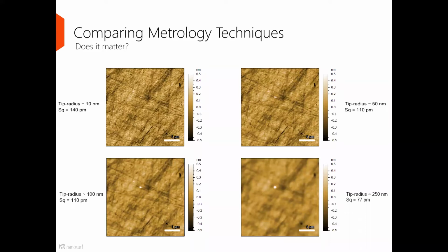Now, what's really important to us as the researcher is what length scale do we want to measure on, and what do we really care about? Because there may be very valid reasons that we want to zoom in and see the high fidelity measurement, but there may also be times when we're looking at much more global phenomena, and a lower resolution will suffice.